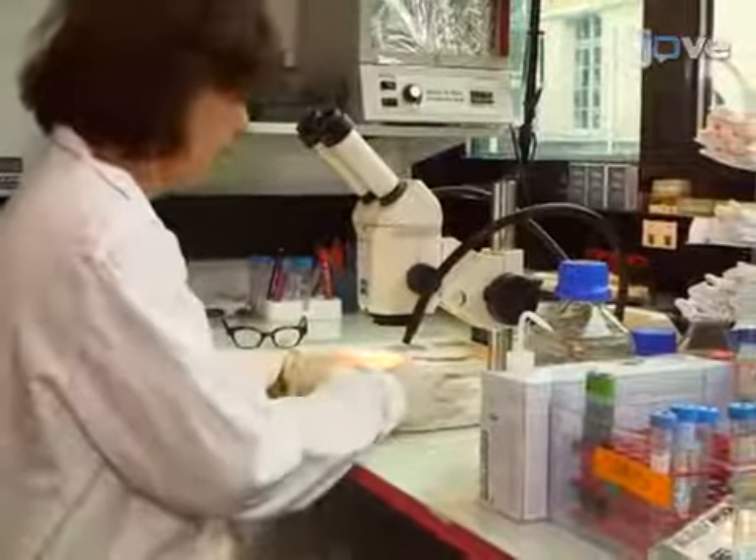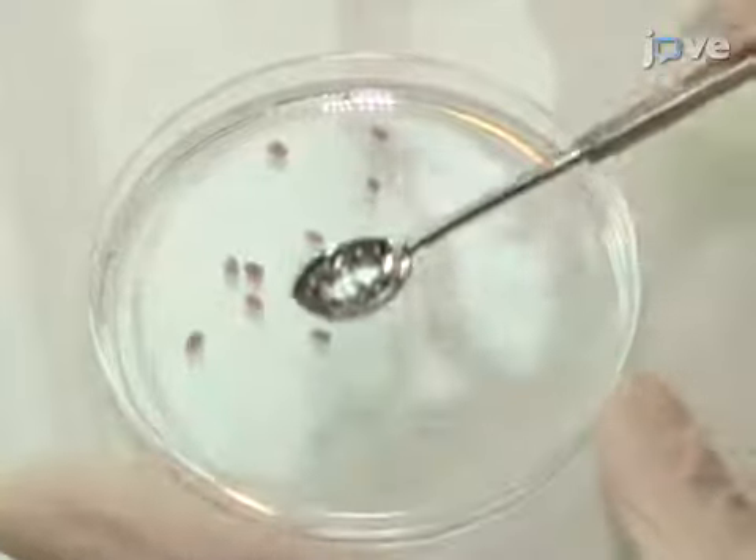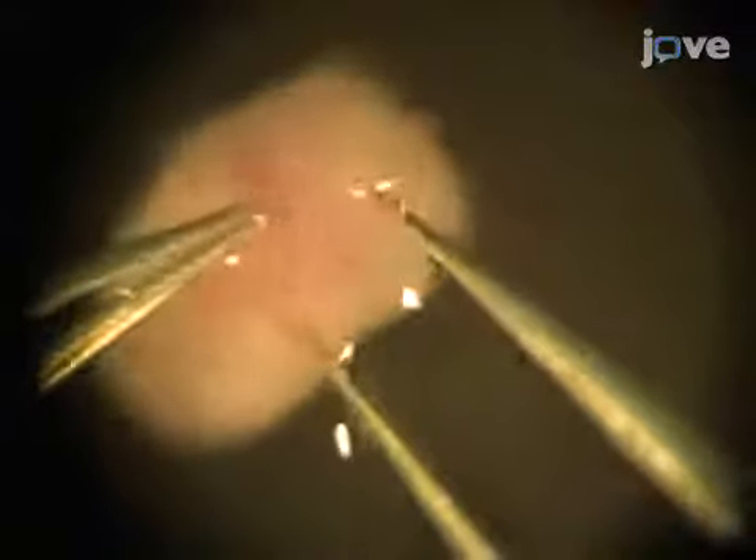To begin, isolate E7 conceptuses in PBS in a 60mm dish. First, dissect the embryo — begin with forceps, pierce the sample, and open and tear the two sides of the decidua apart. Then, shell out the embryo. Use the fine forceps tips in a scissor-like fashion to carefully separate the ectoplacental cone, or EPC, from the embryo proper.